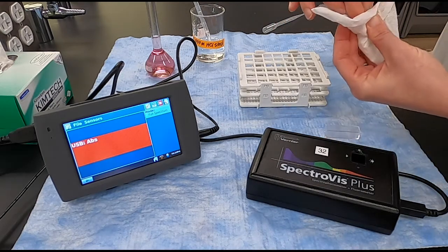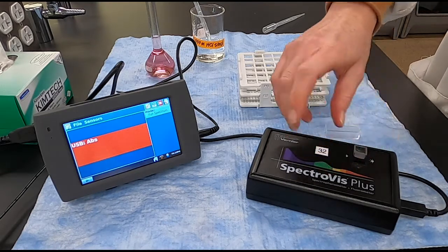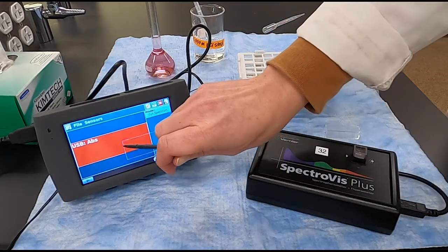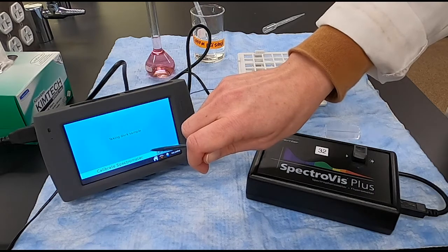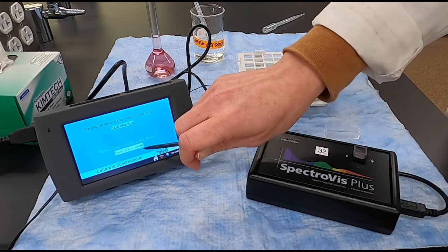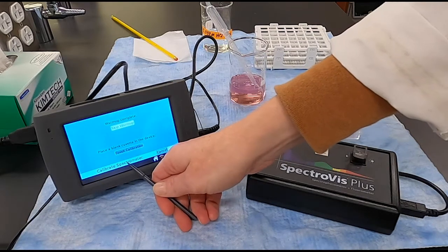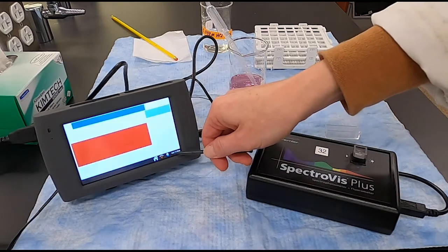To start out, we're going to use our hydrochloric acid stock solution to calibrate the SpectraVis Plus. Like usual, to calibrate, you're going to click on the red box and choose calibrate. It does have to go through a warm-up process, so I have skipped that this time. When it's done, you're going to press finish calibration and then OK.